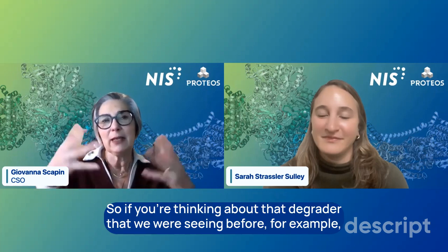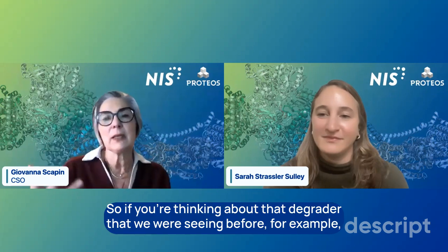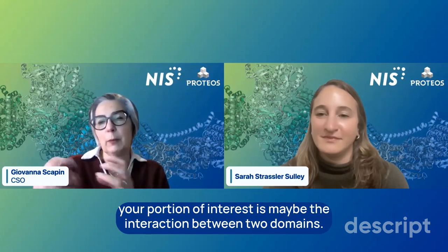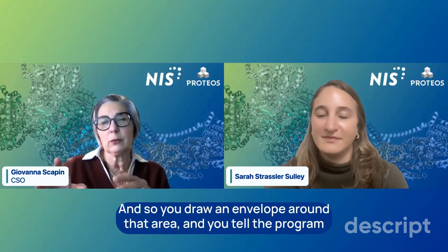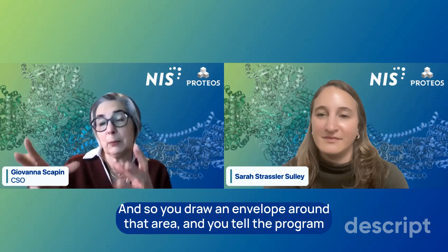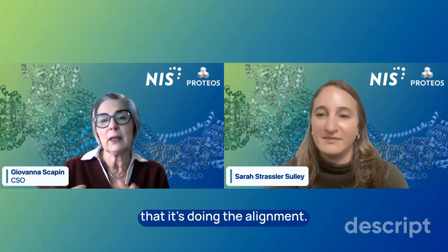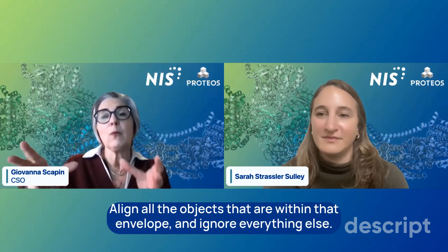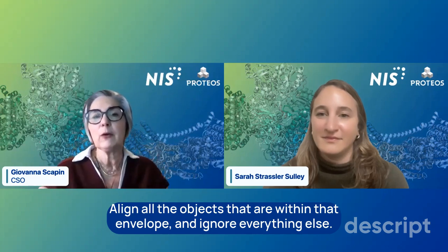So if you're thinking about the degrader that we were seeing before, for example, your portion of interest is maybe the interaction between two domains. And so you draw an envelope around that area and you tell the program that is doing the alignment, align all the objects that are within that envelope and ignore everything else.